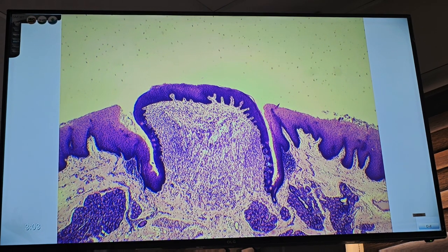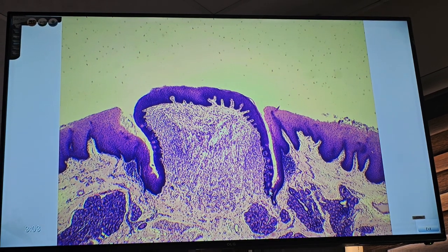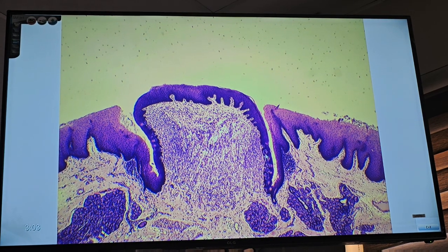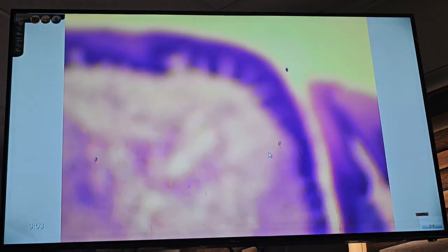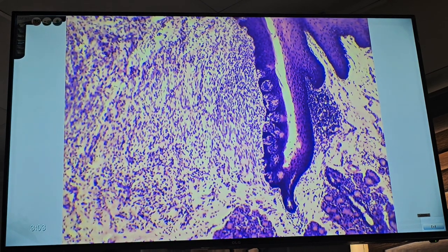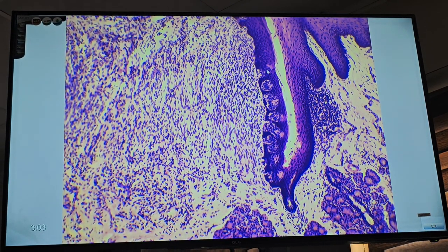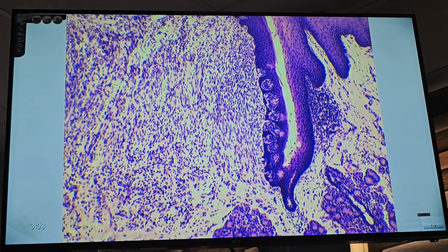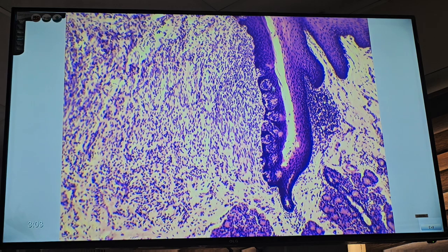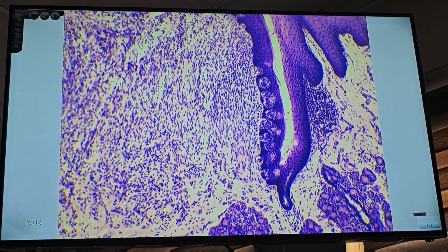On the lateral surface of the vallate papilla, we can see taste buds. Each bud has an ovoid shape. These are taste buds. They are found on the lateral surface of the vallate papilla. Each taste bud has an ovoid shape and consists of 3 types of cells.